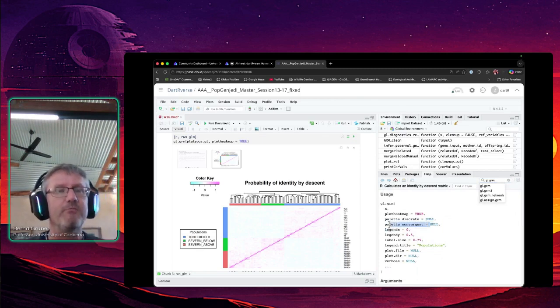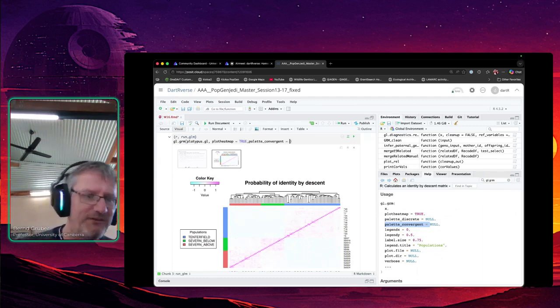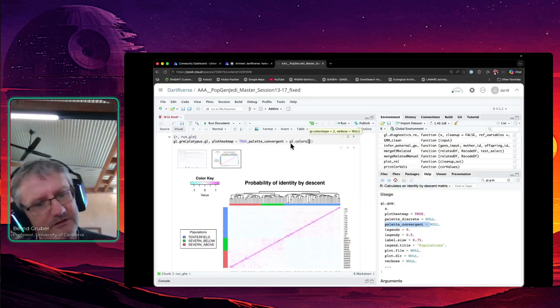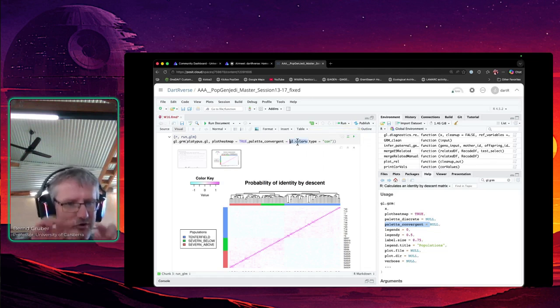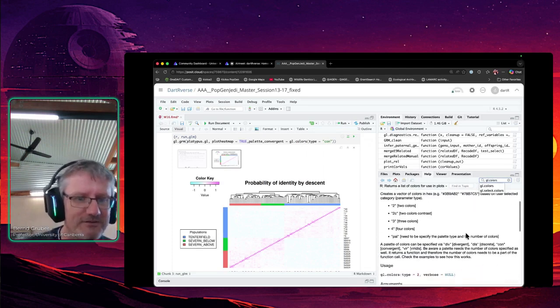These are the individuals within the population, and they have higher relatedness values than between the populations. So you can see here also the population structure if you want. And you can see also, if you look at the dendrogram, how closely related they are: for example, the blue guys, you see some which have a really short branch, so the relatedness value is fairly high, and then you have some that are just really low.